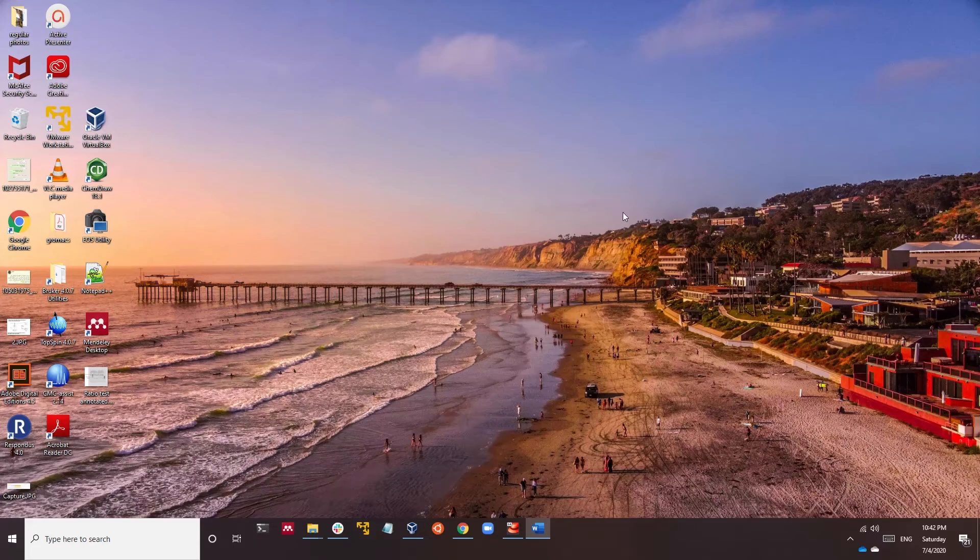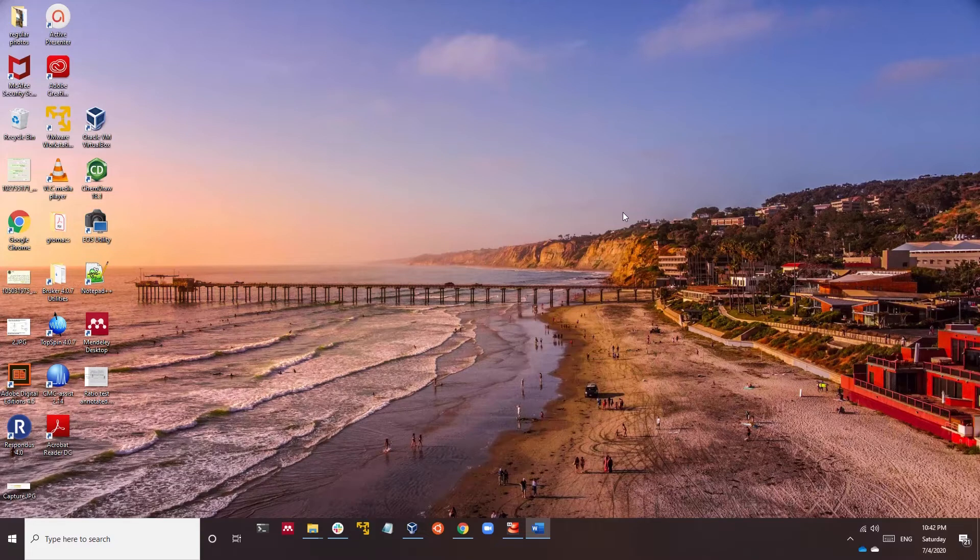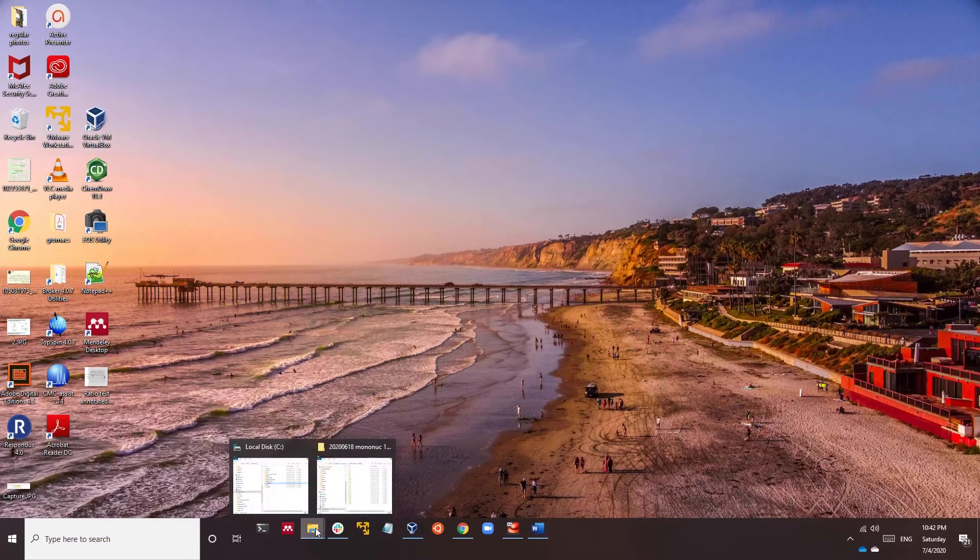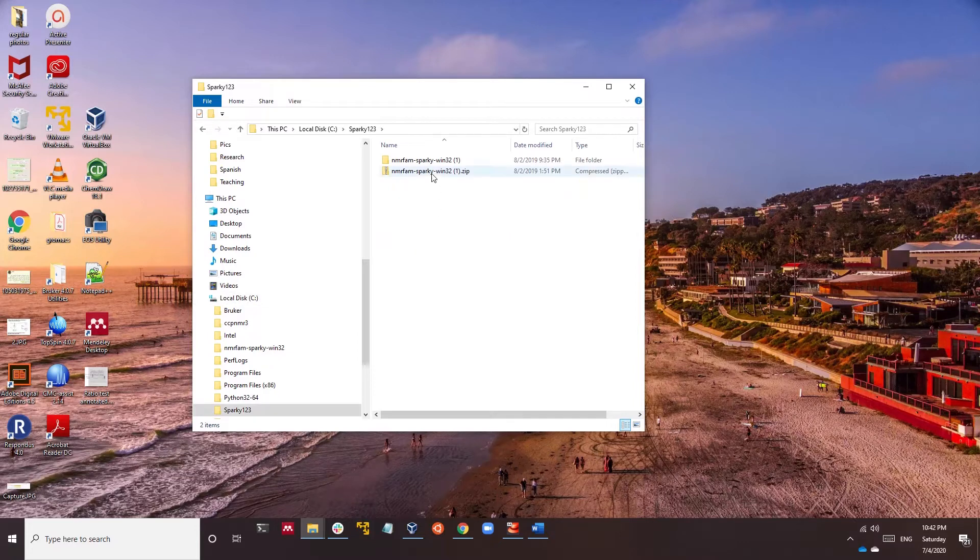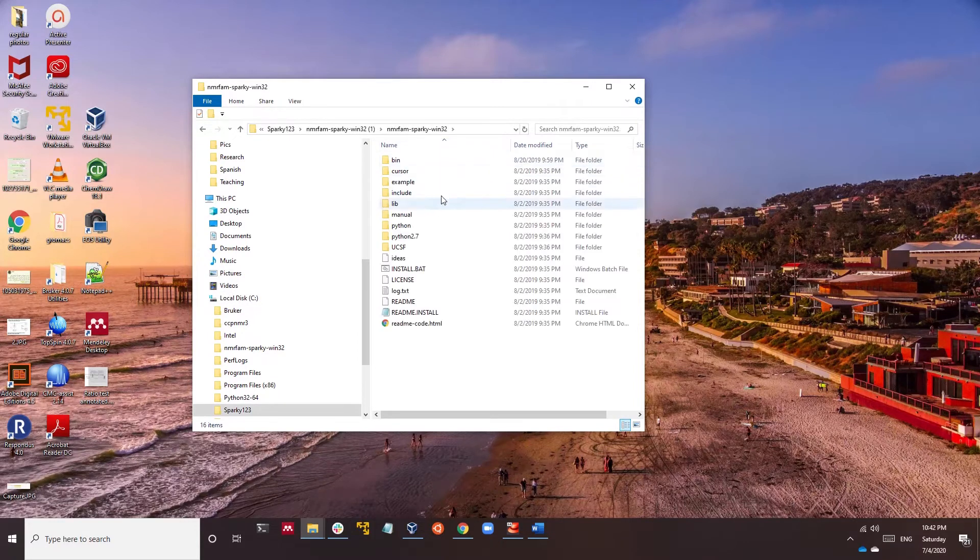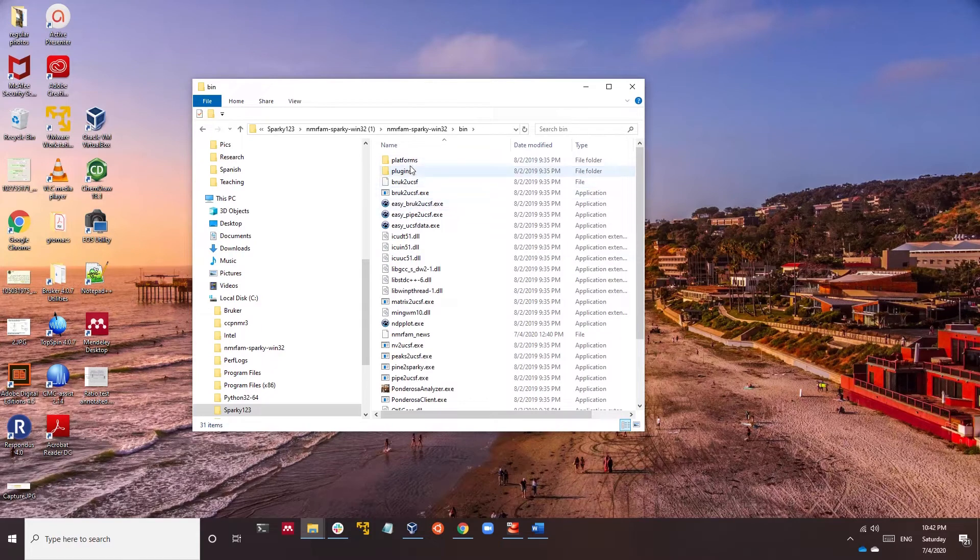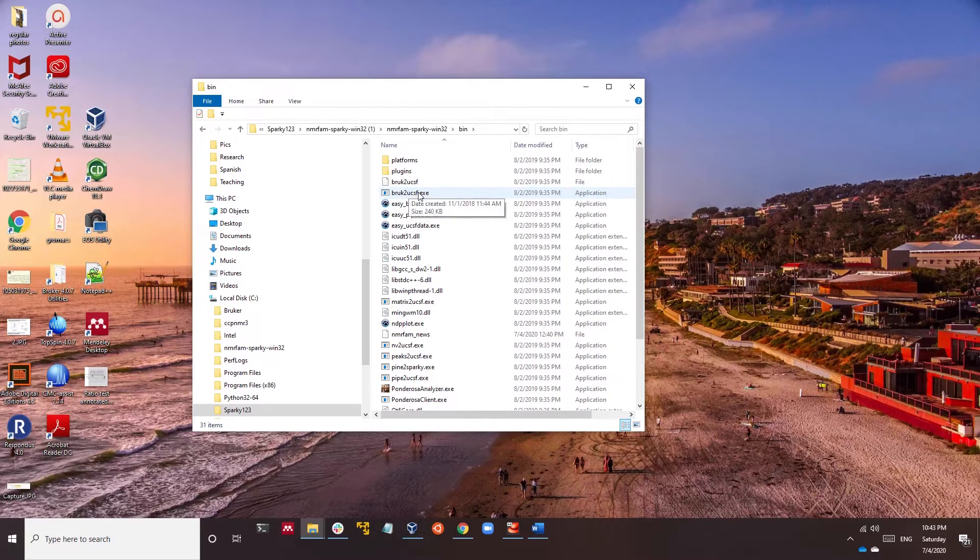Hi, in this video I'll show you how to convert your Bruker file to a UCSF file. When you go to Sparky in your local disk, in the folder you will find a folder called bin. In this folder you'll find a tool that can be used to convert Bruker files to UCSF.